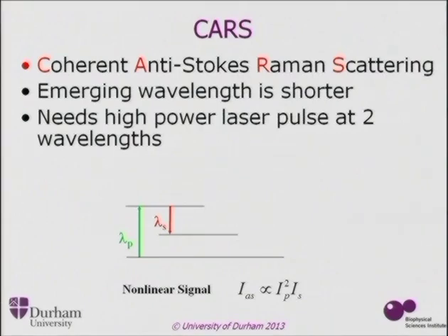So they don't go back right down here. We've driven vibrations down to that point. Then normally another photon is absorbed, the same as the pump wavelength, where it gets excited up again. And then in the end, we detect the wavelength coming from this higher level.